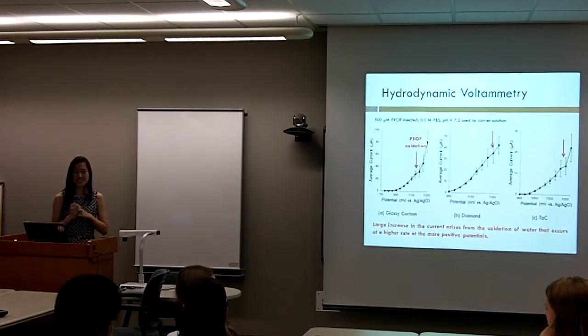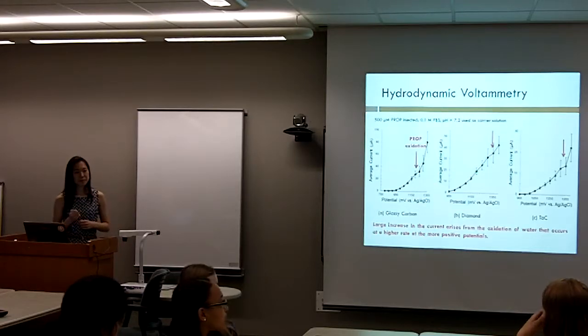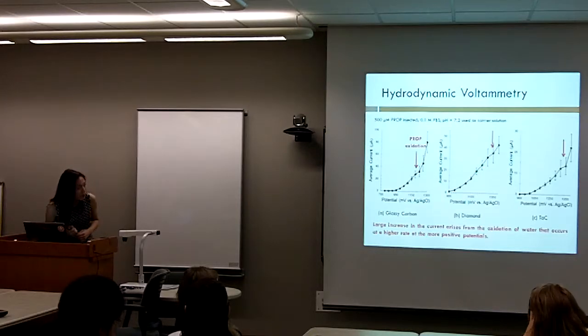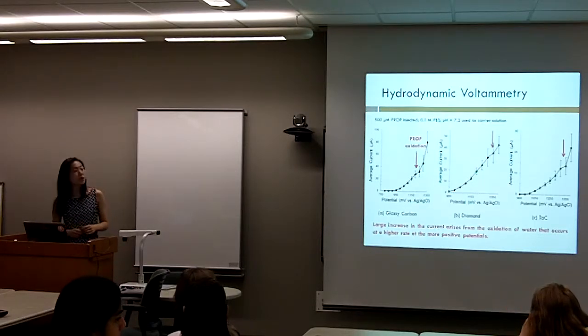Any other questions? Following up on that question, when you see the diamond graph there, it looks like it could be considered plateauing, two dots to the left of where you have the arrow. So is it exactly where it first happens, or how do you differentiate between the two? Because it almost looks like it plateaus. Oh, at 1250.